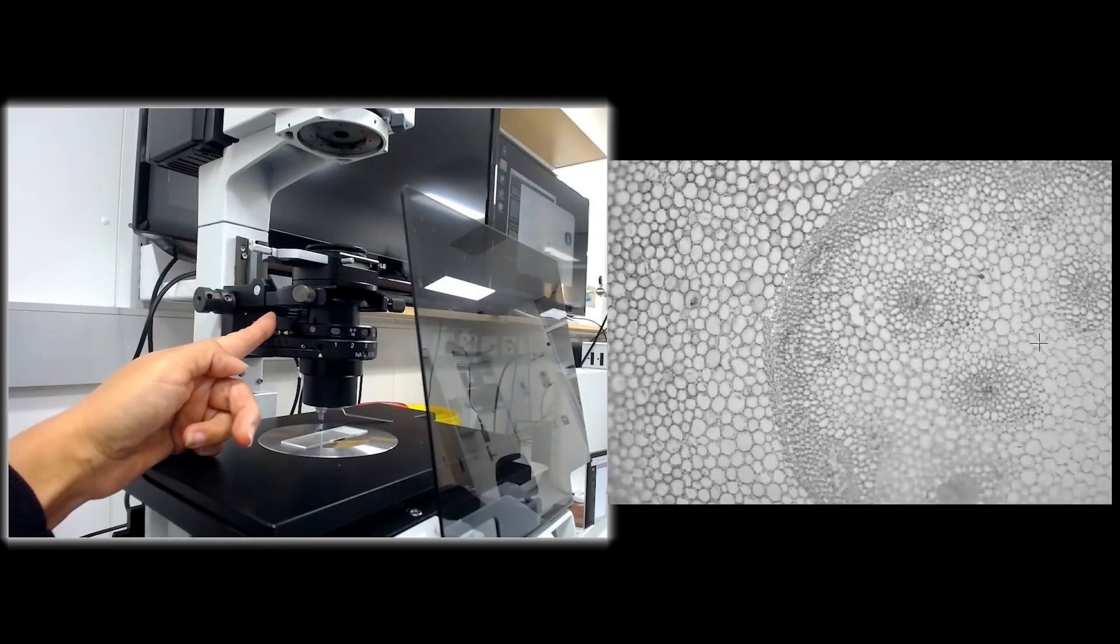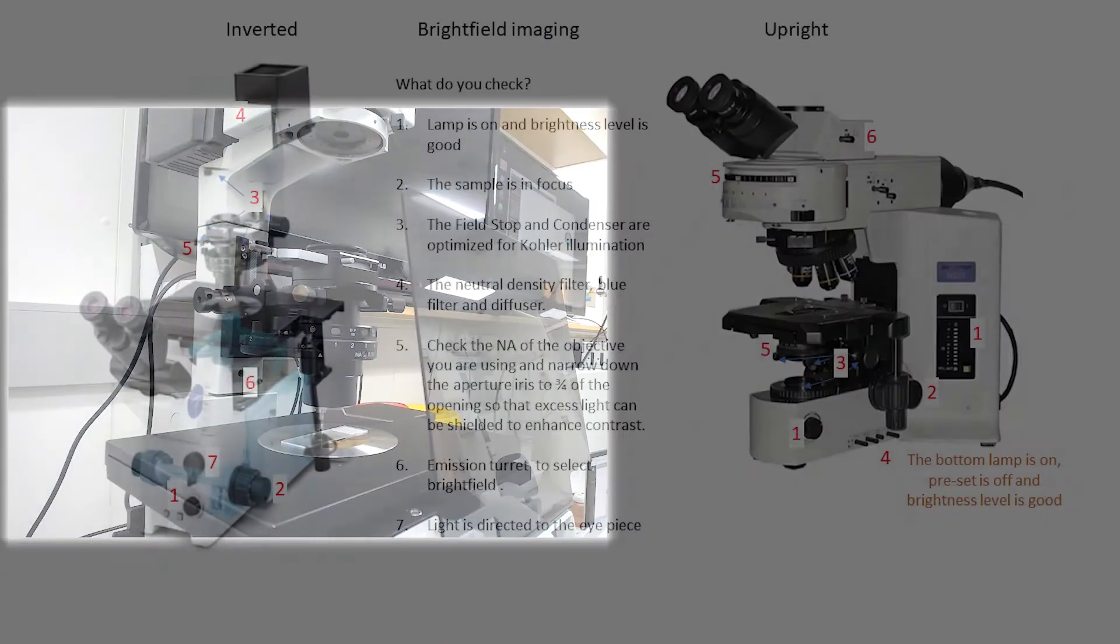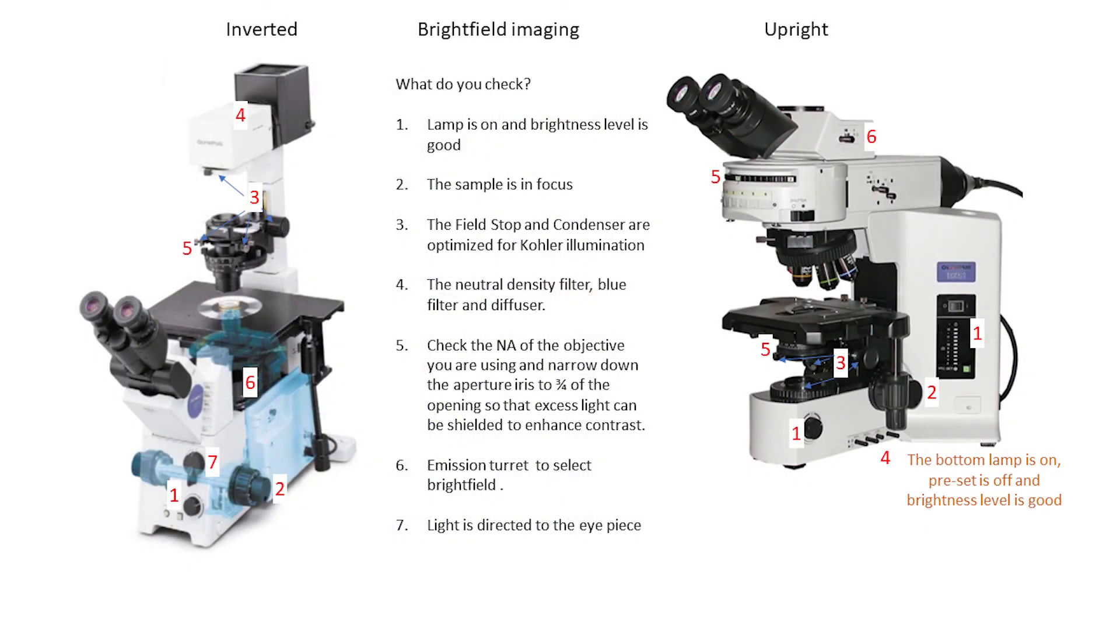Now move the aperture stop slider to control the contrast in your image as required.